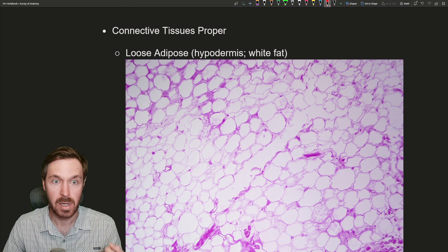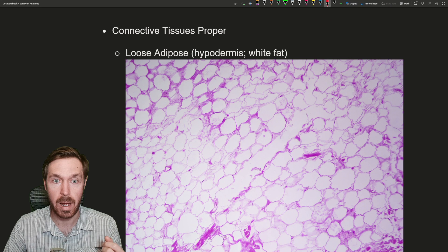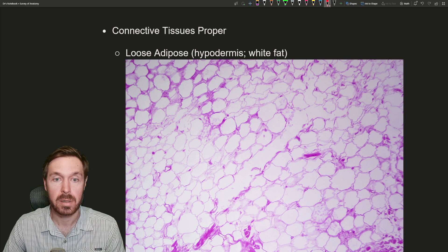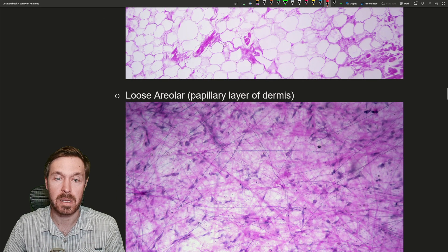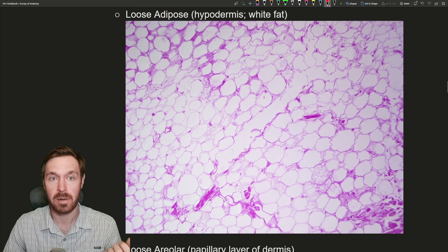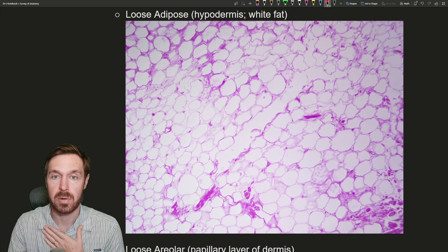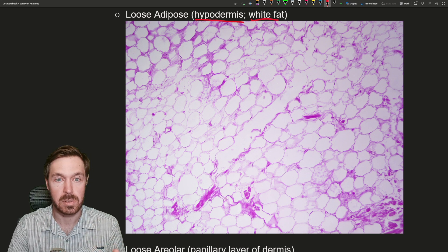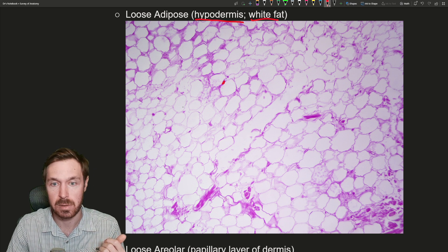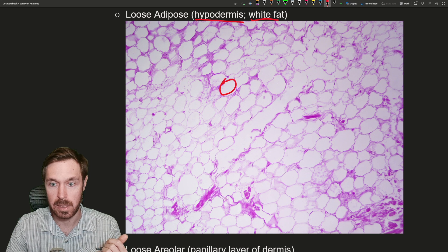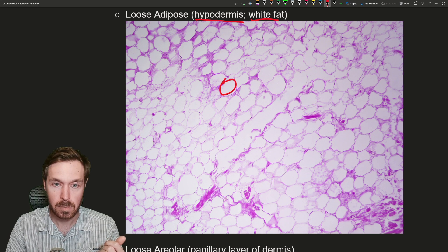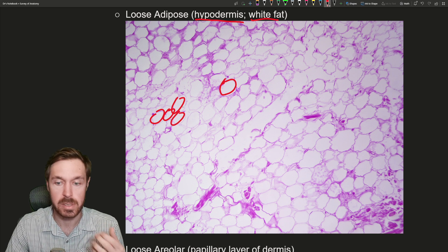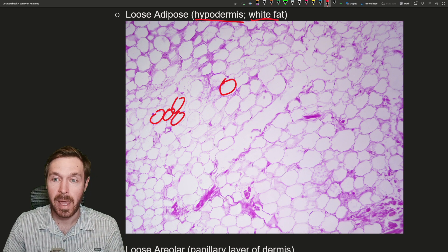Now we go into our connective tissues, beginning with connective tissue proper. We have loose and dense types: loose includes adipose, areolar, and reticular; dense includes regular, irregular, and elastic. First up is loose adipose, from the hypodermis — a white fat layer deep to the dermis. Here we see the oil droplets with little nuclei. These are called adipocytes. It looks like droplets of oil and water — this is fat storage.